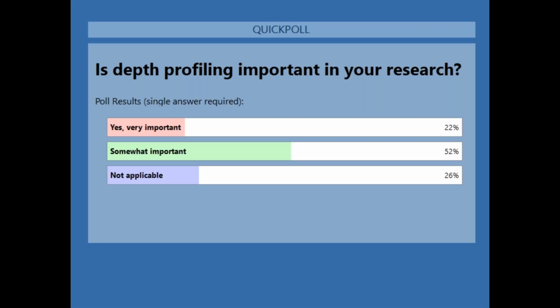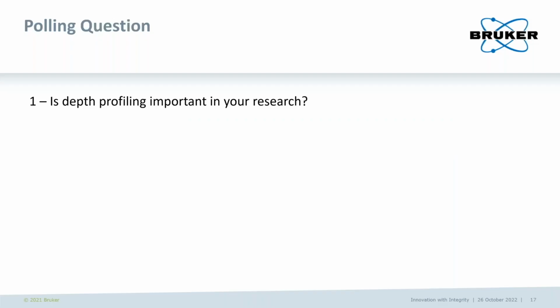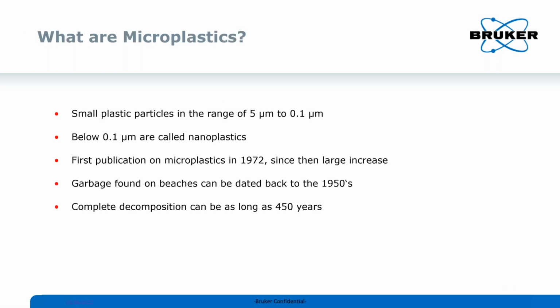Well, thank you for that, Lauren. I think that's a really profound result. About 3/4 of everyone attending are interested in depth profiling. So I'll spend a little more time than I normally do on that particular part of the presentation. So very good feedback. Okay, so the next thing I wanted to talk about is microplastics.